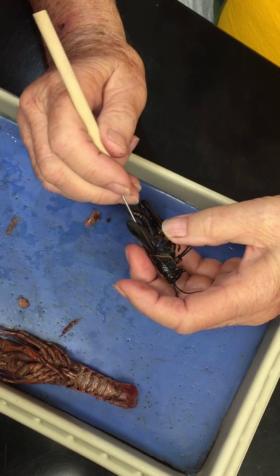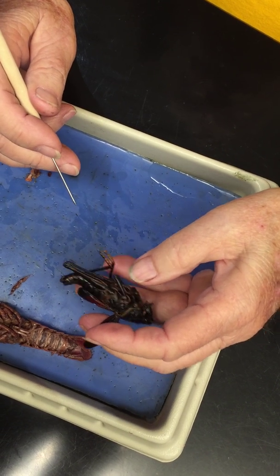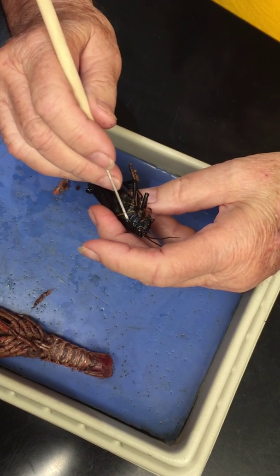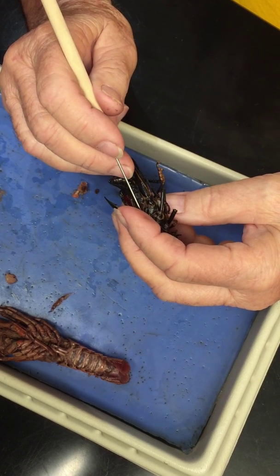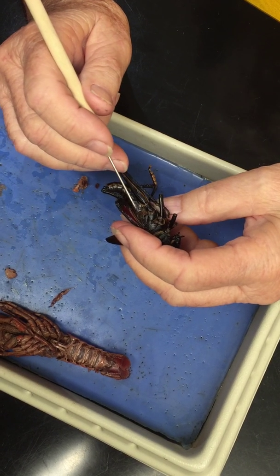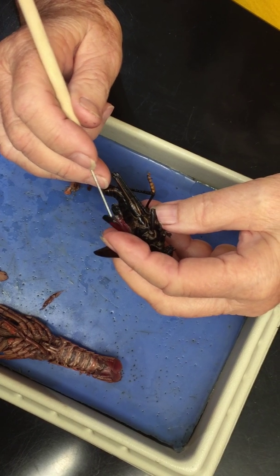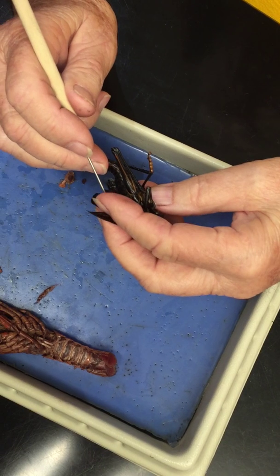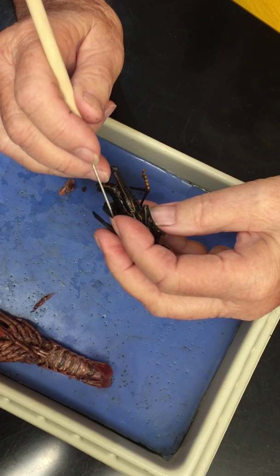Now, that's the mesothoracic wing. Got to remember, there's a prothorax here. This is a notum or something coming out here. This is the mesothorax, and this is the metathorax. This is the mesothoracic wing. It's on the mesothorax. This one here, the pretty red one, that's the metathoracic wing. The lines in the metathoracic wing are trachea.